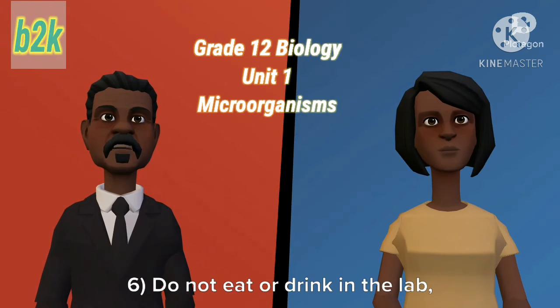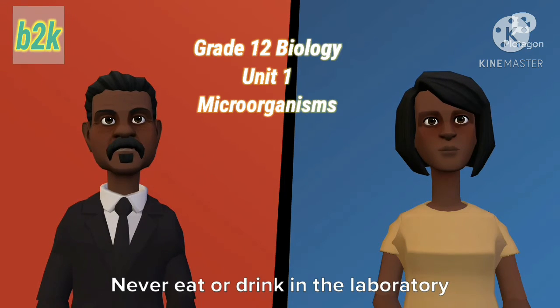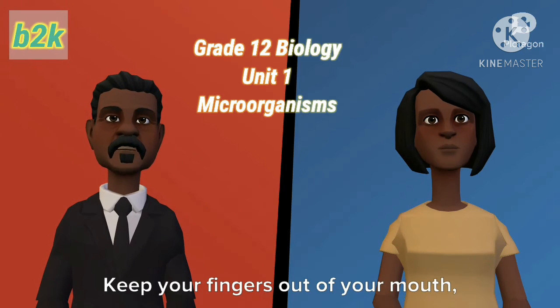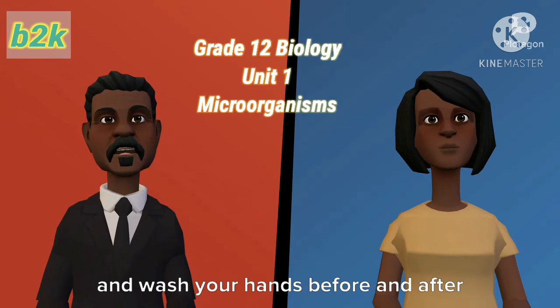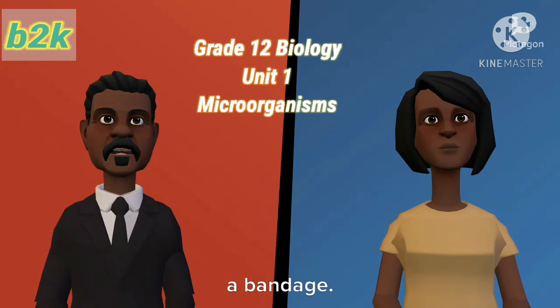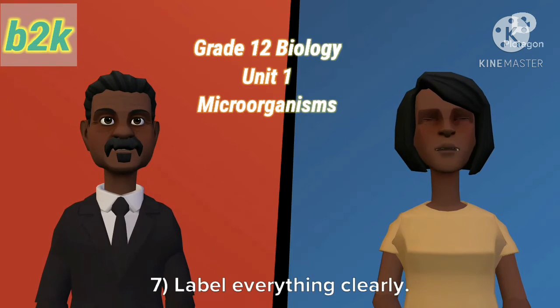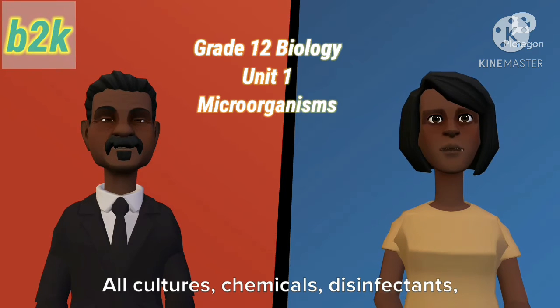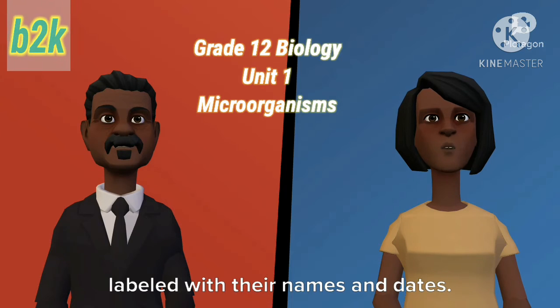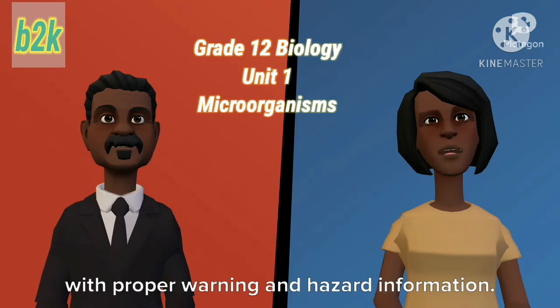6. Do not eat or drink in the lab, nor store food in areas where microorganisms are stored. Never eat or drink in the laboratory while working with microorganisms. Keep your fingers out of your mouth, and wash your hands before and after the laboratory activity. Cover any cuts in your hands with a bandage. Gloves may be worn as extra protection. 7. Label everything clearly. All cultures, chemicals, disinfectants, and media should be clearly and securely labeled with their names and dates. If they are hazardous, label them with proper warning and hazard information.